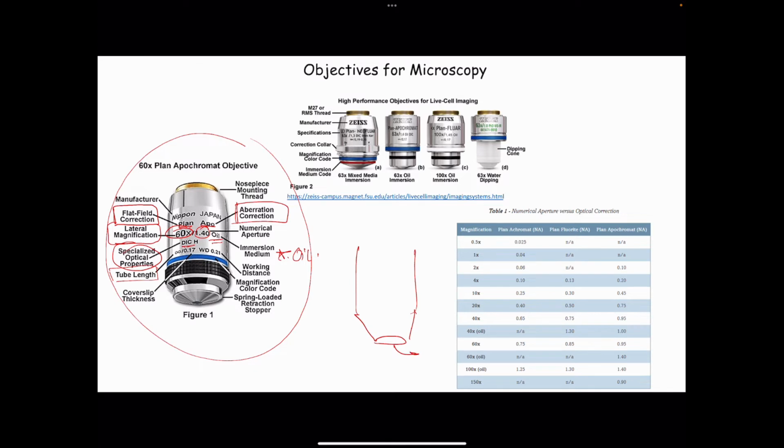It's the front lens, that's the first one. Then there are other lenses in between which you put for different purposes. Some lenses can be to correct the aberration, some would be to actually magnify it more, some will be for flat correction, some will be for spherical corrections and whatnot. So all of this collectively makes your objective assembly of 5 to 6 lenses, each of which has a purpose there.